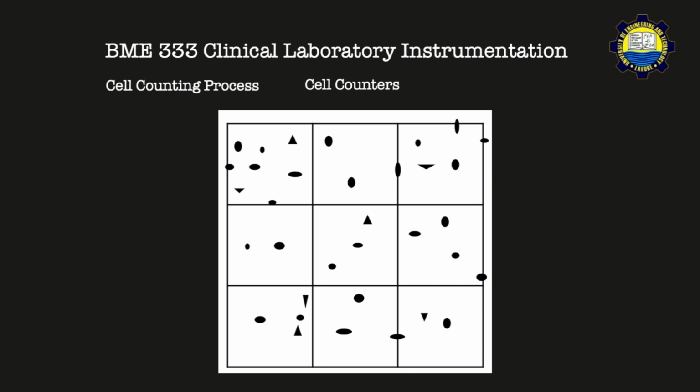And also you would notice that in this particular example you have 2 kinds of cells, the circular ones that are circle and then they become elliptic and then ovalish, and then there are triangular ones as well. So this has been made simpler for you. Instead of color schemes, I've used 2 different shapes.